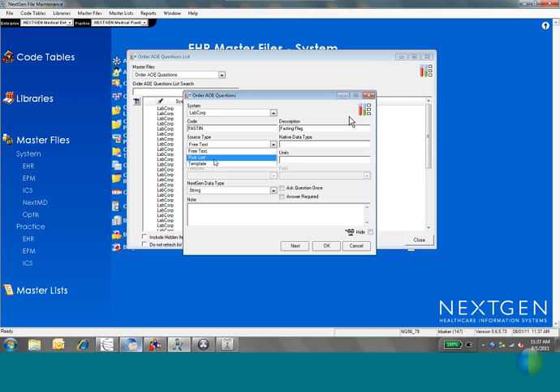Or at the time the order is placed, you can create a pick list, and if you do so, the pick list opens up AOE answer, and it actually requires that you backtrack out to a completely different table called order AOE answers, and you can build a pick list there, so we'll come back to that.